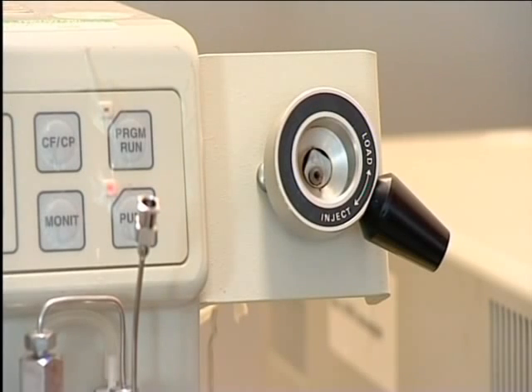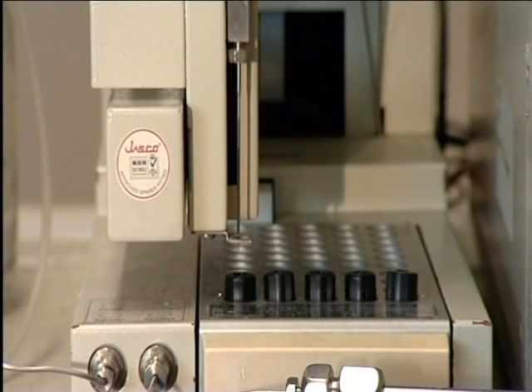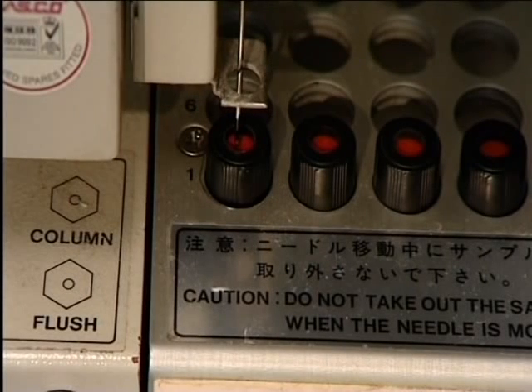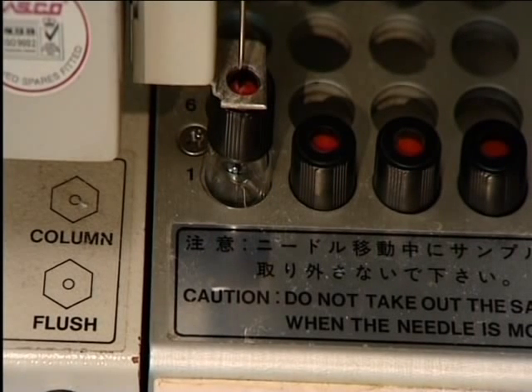If a single sample is to be run, it is injected into the solvent stream here, in the injection port via a hypodermic syringe. Alternatively, several samples can be run in succession by loading them into this auto-sampler, which will run them in order without any human intervention.